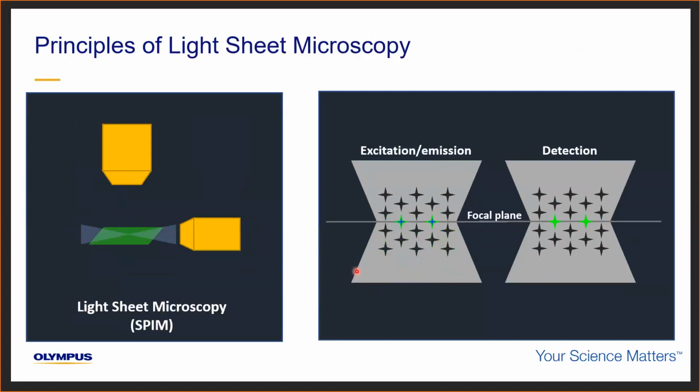In Lightsheet microscopy, the specimen is excited locally with a thin sheet of light instead of a focused spot. The emitted light is detected immediately by a detection objective, which is perpendicular to the illumination axis. Optical sectioning in this configuration is achieved at the illumination plane because only fluorophores in the illumination plane are excited, and there is no signal from fluorophores above or below this plane.